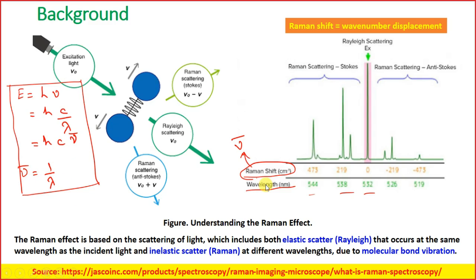Now, if I say that there is a Raman shift, I am basically talking about the wave number displacement.